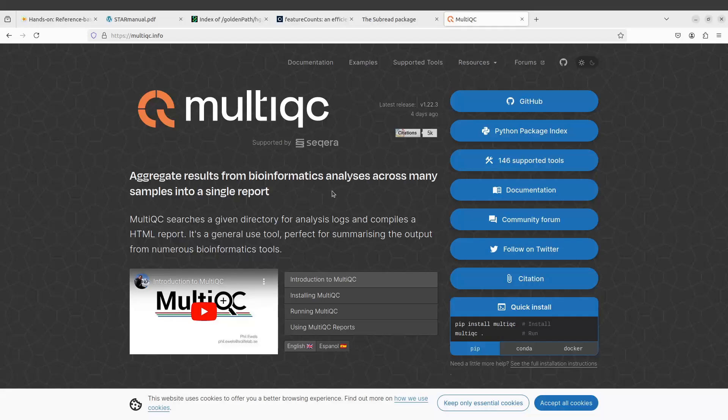MultiQC automatically identifies the files for you, but in this case we want to be specific.